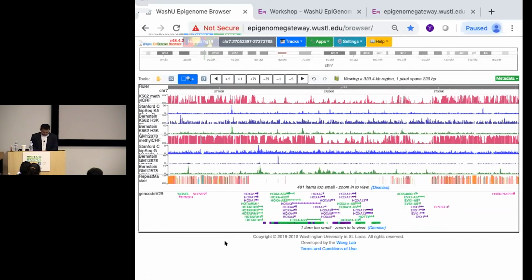Okay, I think I covered, I might be missing certain things, but we've done the go live. Okay, let's now do the Hi-C part.